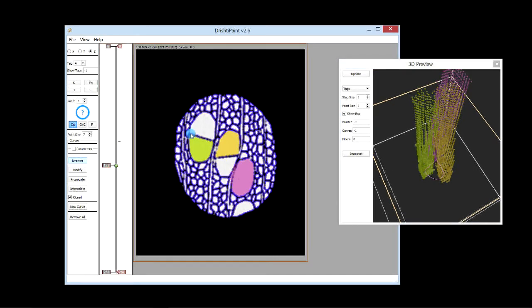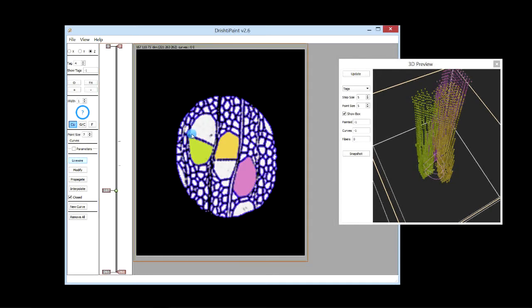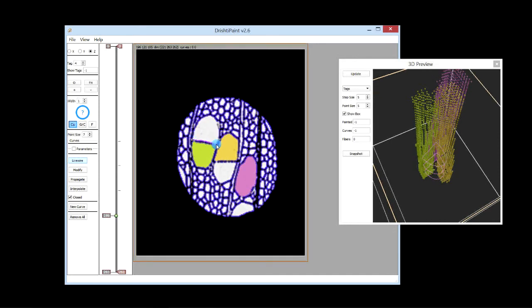Let's go to another one here. So here I'm just moving the cursor, and the curve will be drawn automatically. So for example, if I move it here around, this is the minimal energy path as calculated by the algorithm, and then I can similarly here. Now this is a very simple example, but in subsequent videos we will see more complicated examples.